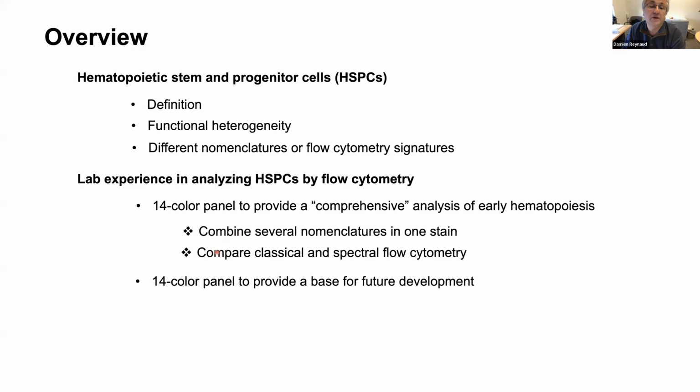We also use this panel to compare classical flow cytometry with spectral flow cytometry. Since 2020, my lab almost exclusively shifted toward spectral flow cytometry, which we found easier to manage.